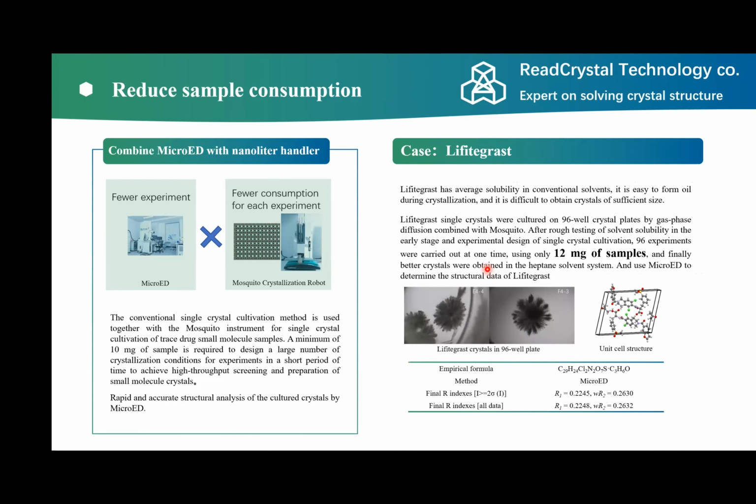This example is about reducing the sample consumption. As I mentioned before, sample consumption is a concern for medicinal chemists as well as biologists, because their samples are quite precious. We combined the micro-ED technology with the mosquito crystallization robot.